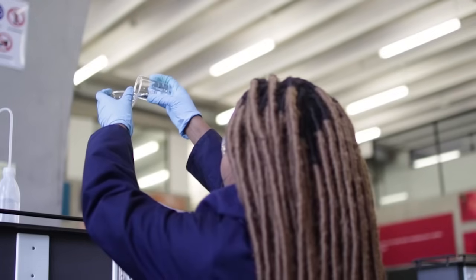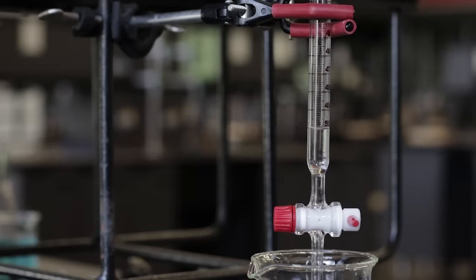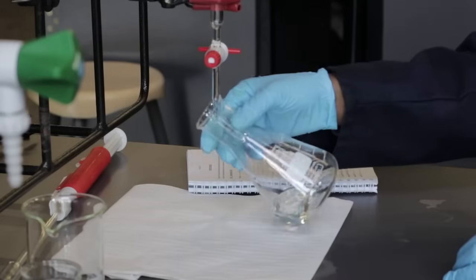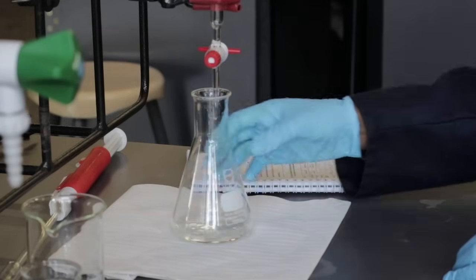A second solution is placed in a burette. This is the titrant. This solution contains a chemical that will react with the analyte chemical sample in the conical flask.